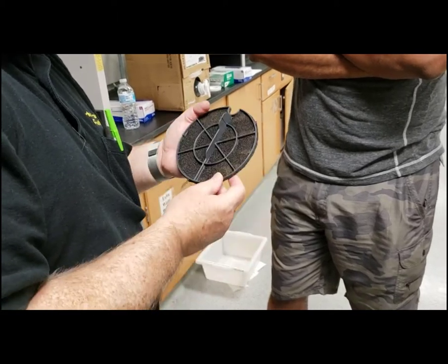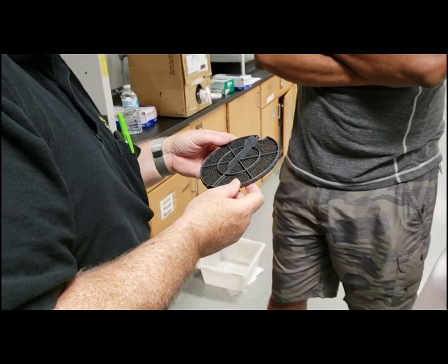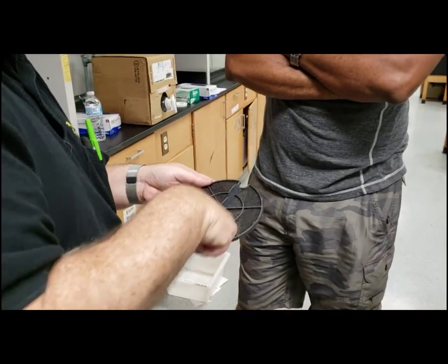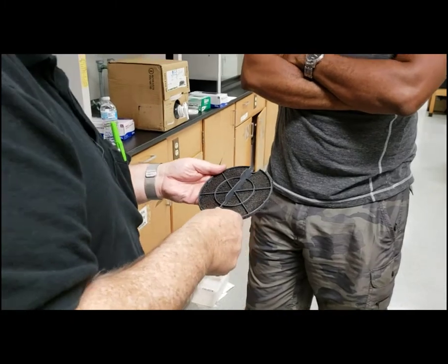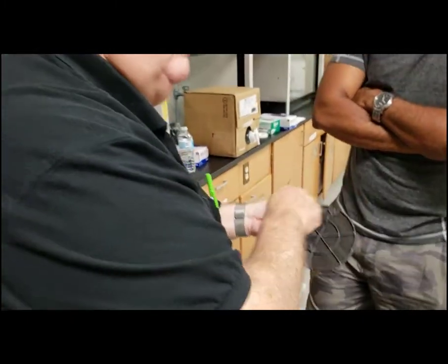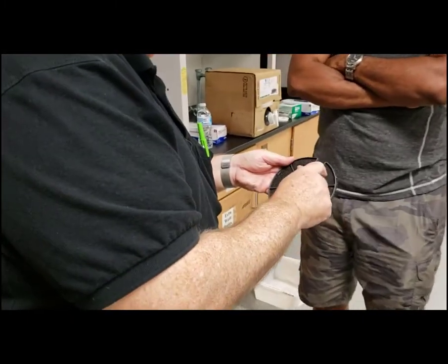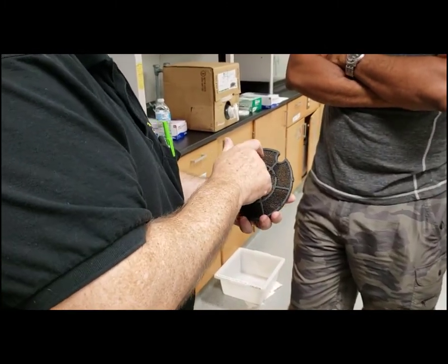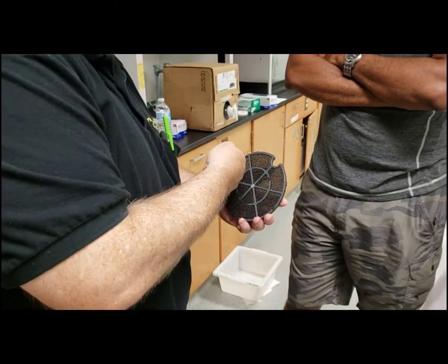So you have 3 ways of cleaning it. You can either take this and vacuum it, with a shop vac. You can take it if you have like an air supply and blow air. But the thing is, you want to blow it from the backside, but you don't want to rupture this. So you don't want it so much that it blasts it.